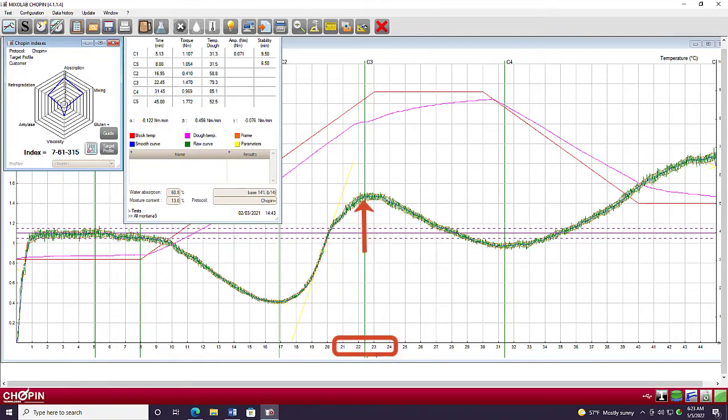And then, of course, the viscosity at cooling, which is all the way down here, this portion of the curve. So this would be your C5 value here. So this really gives an indication of potential shelf life, especially related to texture, that starch retrogradation that impacts the firming of bread over time. Those are all things that you can pick up from this test looking at these curves, but there's a lot more than that.